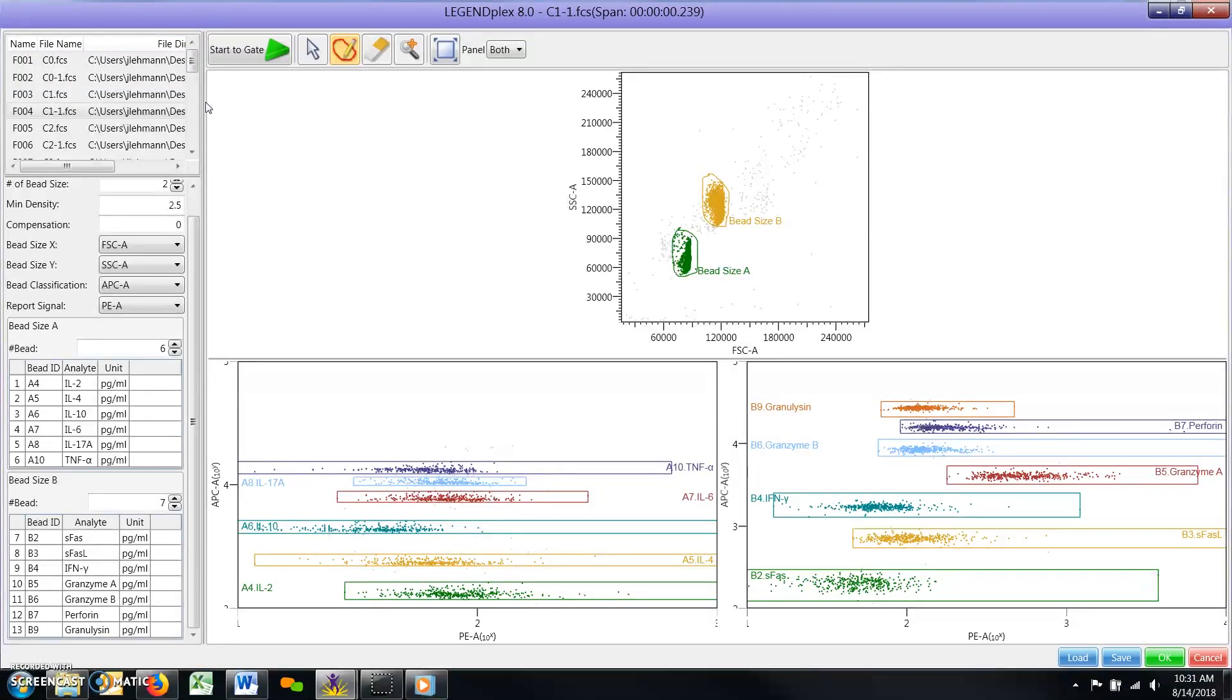Provided your flow cytometer was properly set up during acquisition, there should be good resolution between all bead populations on the scatter plots.